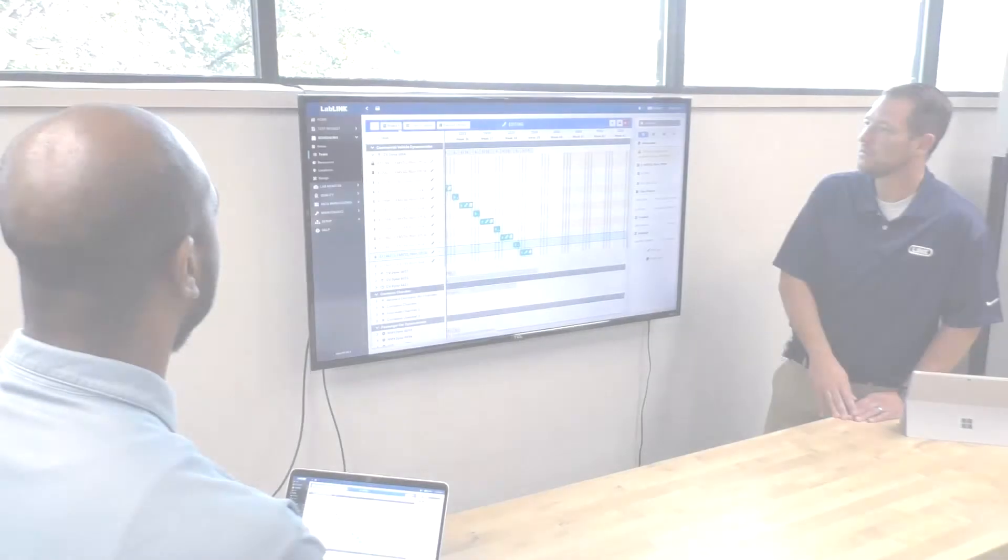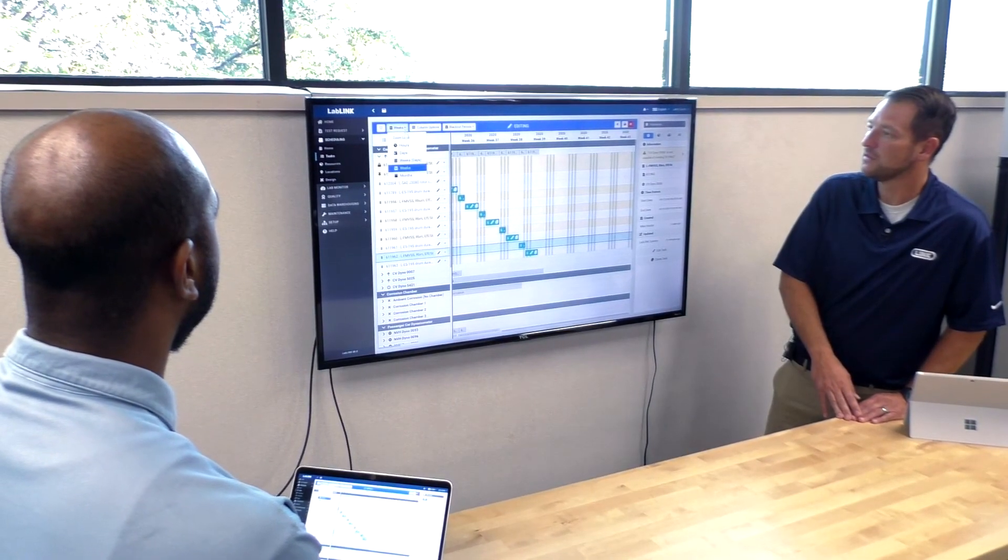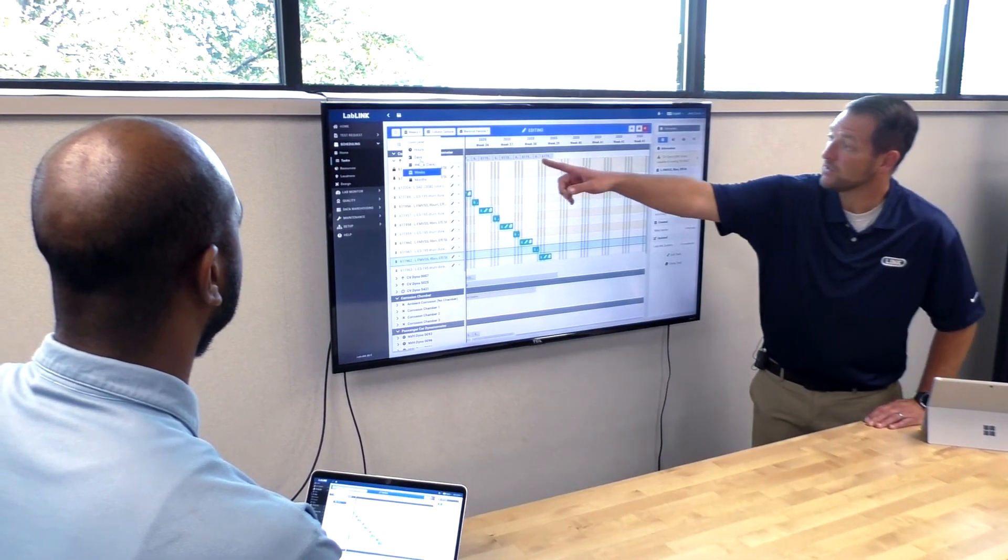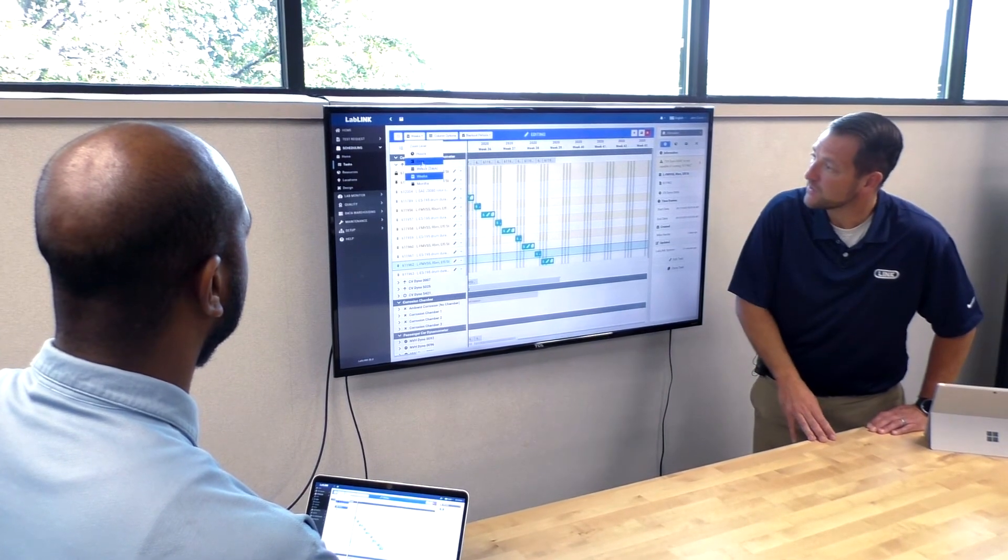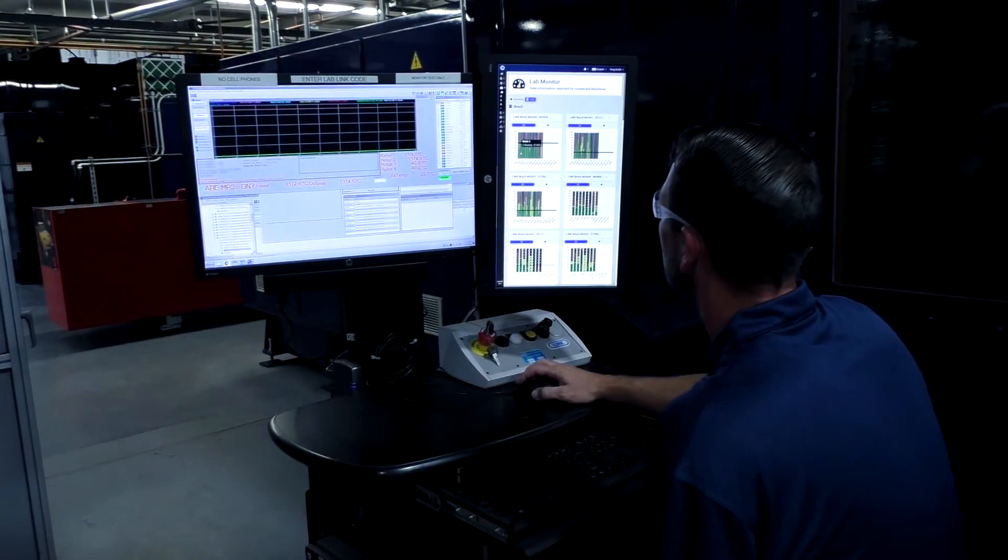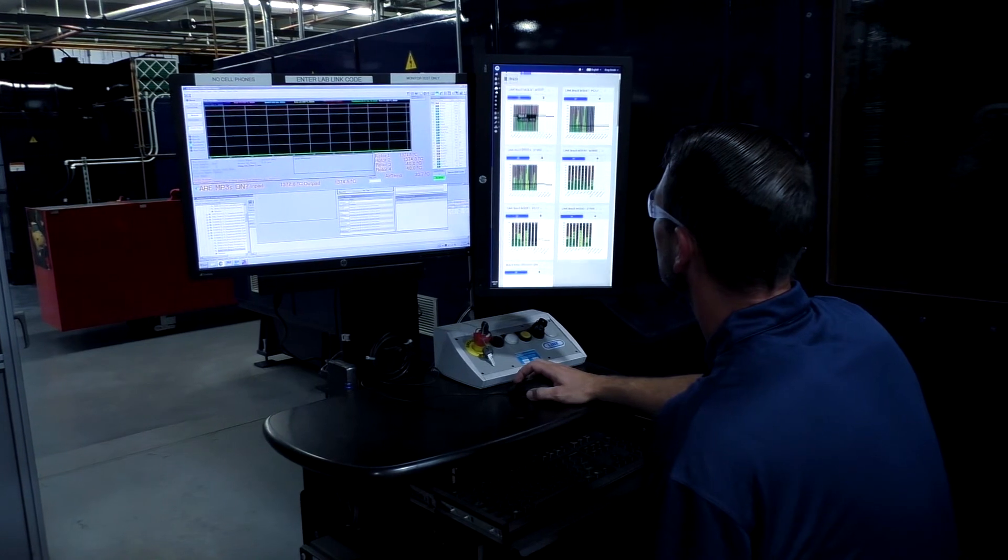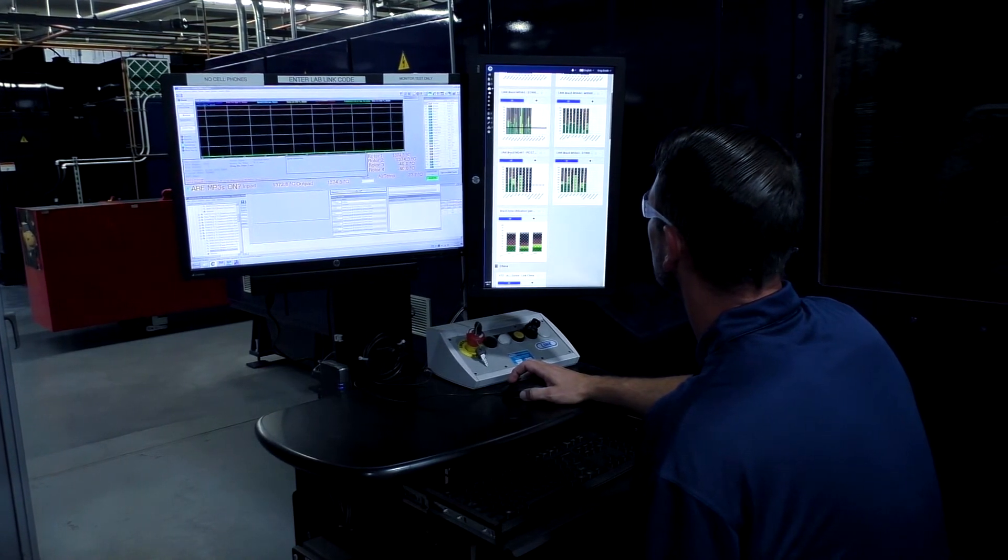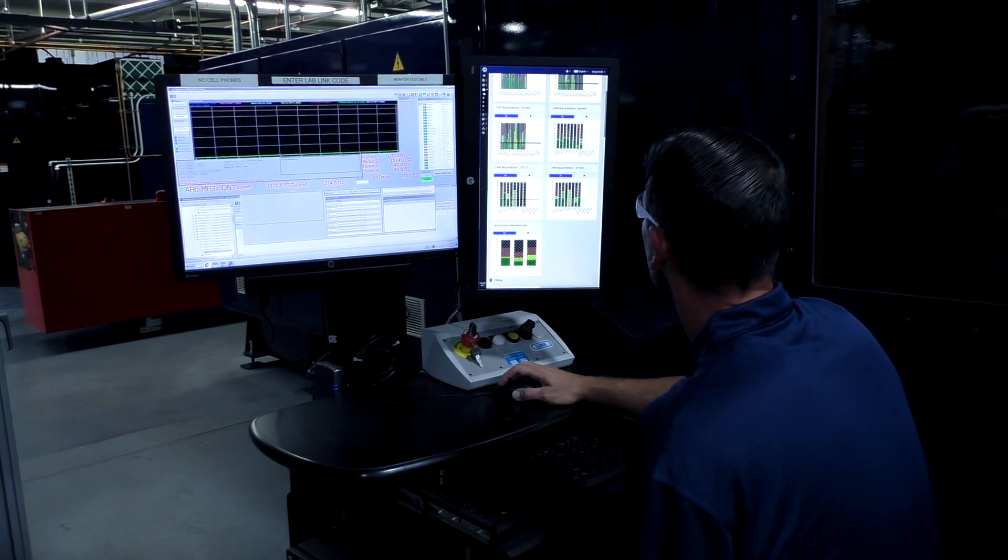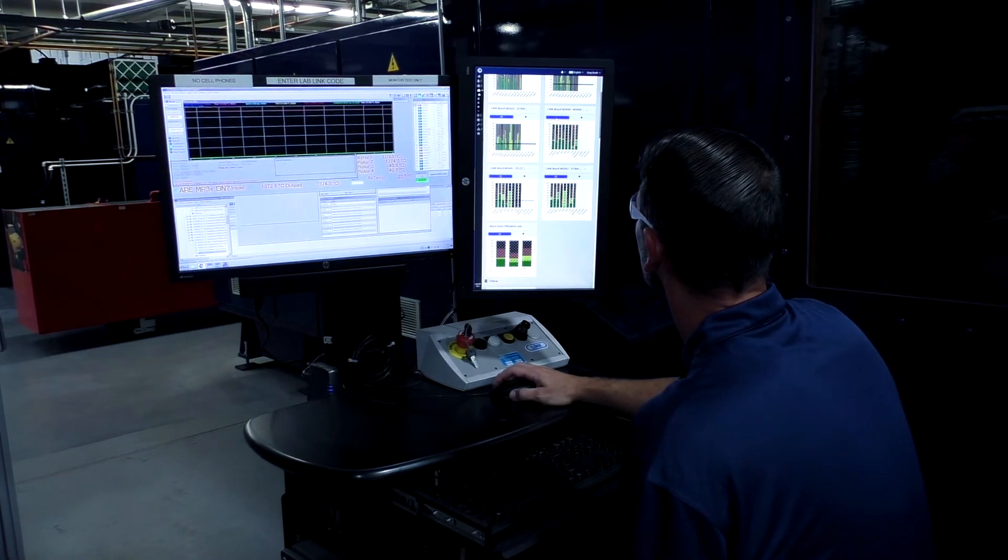LabLink was developed with the end user in mind. Since this software was first used in our own laboratories around the world, it is safe to say we have put it to the test. We know that truly understanding the laboratory and asset utilization is a top priority in any lab because we have the same need.